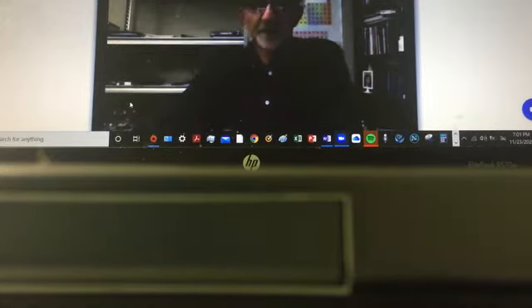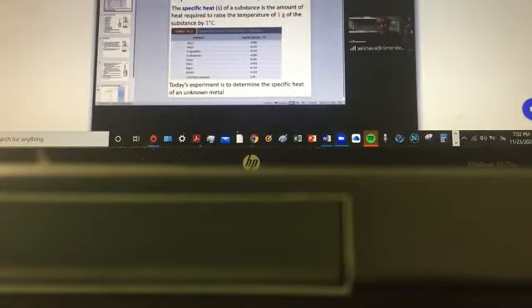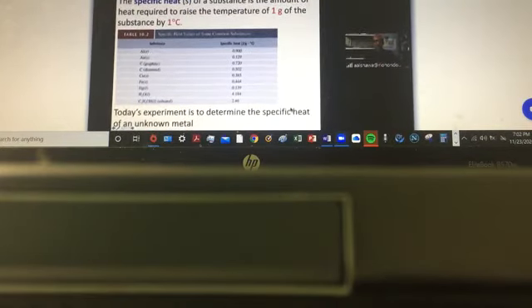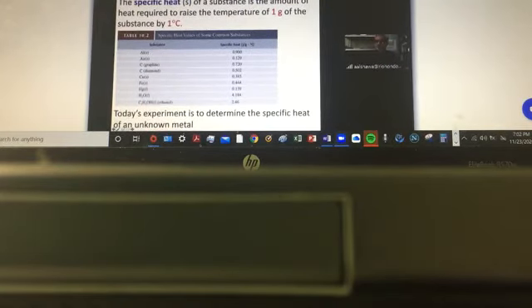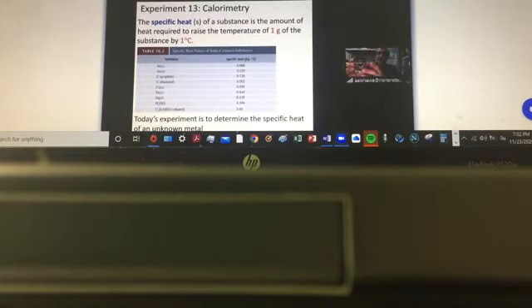All right, are we together? Let me share the PowerPoint with you, so we'll go over the steps to be done. The whole idea is to measure the specific heat of an unknown metal. We have some metal with an unknown identity, and we're trying to figure out its specific heat.